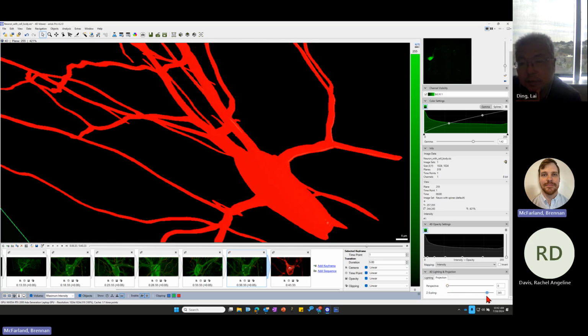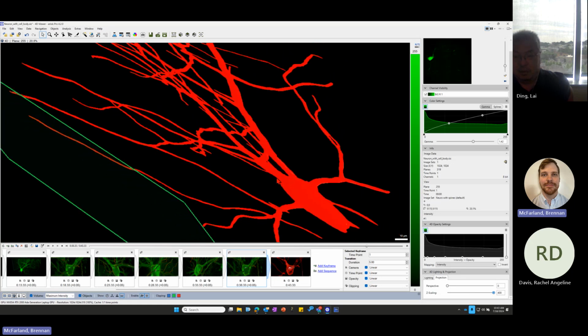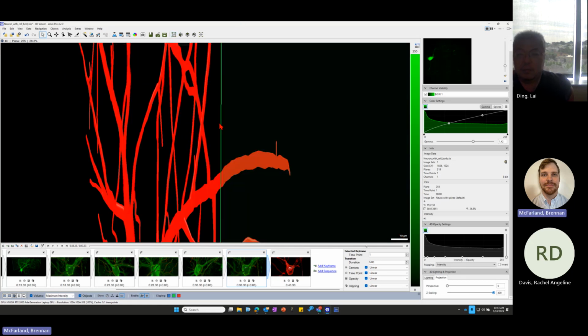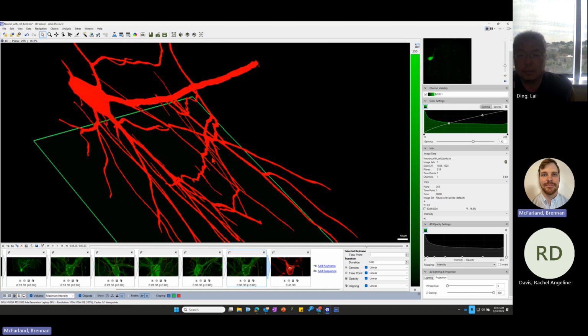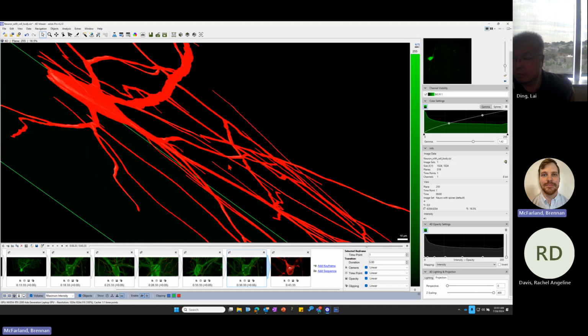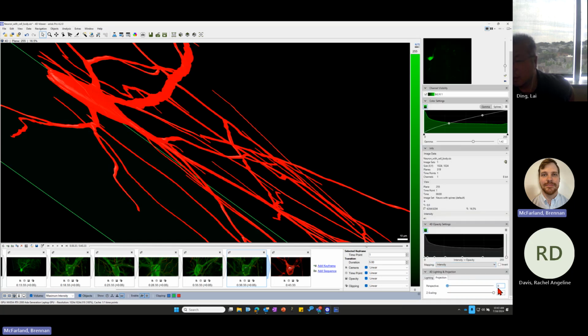You can adjust the Z scaling, so kind of how elongated we want this structure to be. It can look pretty interesting. Like really, really elongated. So you can bring out your inner director, and if you want to do something like this with crazy perspective, go ahead. And then I don't think I touched on these points here, so let me reset this back to normal.